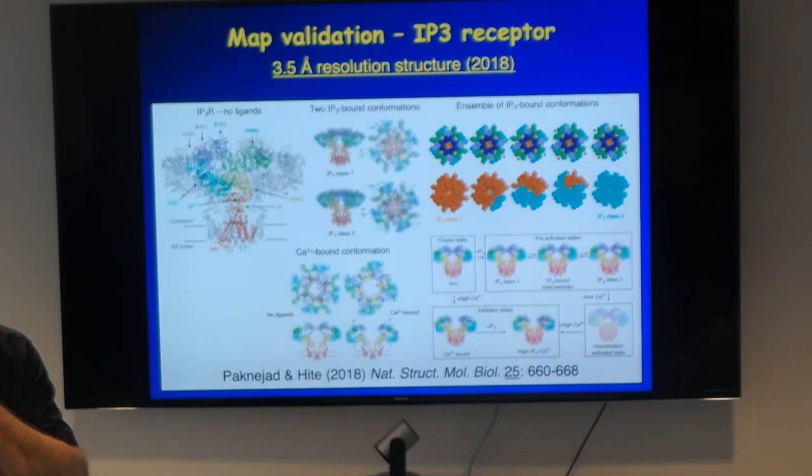My NMR knowledge is too limited to answer this. I feel like you would actually be able to just do this in single particle, just classify out if you were to mix two samples. I don't know why you would, but you could in silico.